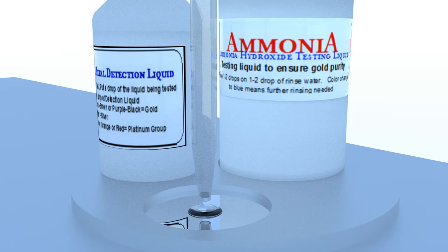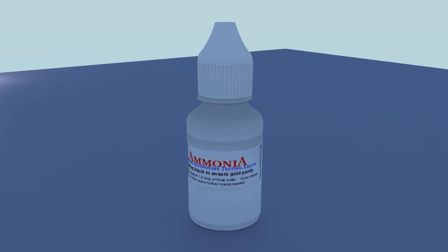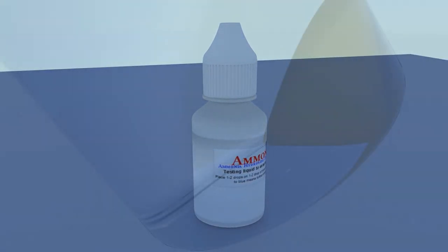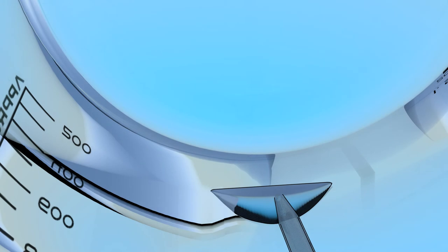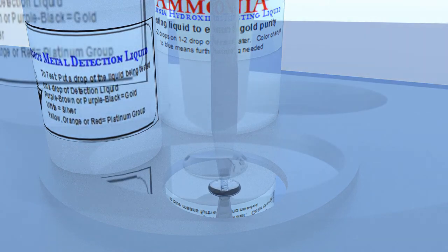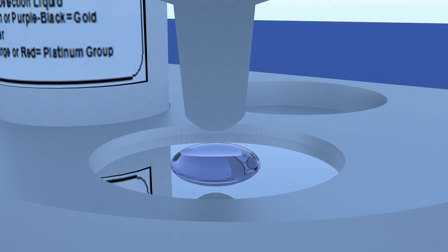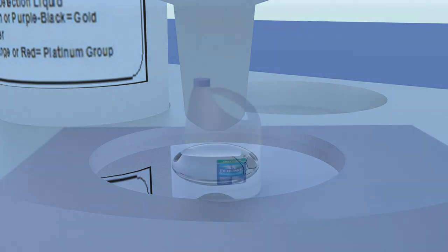The test for impurities is very similar to the test for dissolved gold, and it has a similar degree of sensitivity, 4 parts impurities per million parts of solution. This test however uses aqua ammonia test solution. Tilt your beaker so that the small amount of water clinging to the mud rolls down to form a small puddle in the corner of the beaker. Using the pipette, take a sample of the water and place a drop or two on the spot plate. Now, add a drop or two of ammonia test liquid. Any change to blue, even the palest shade of blue, indicates impurities and another rinse is required. When the test runs clean with no hint of color change, you can do a final rinse.